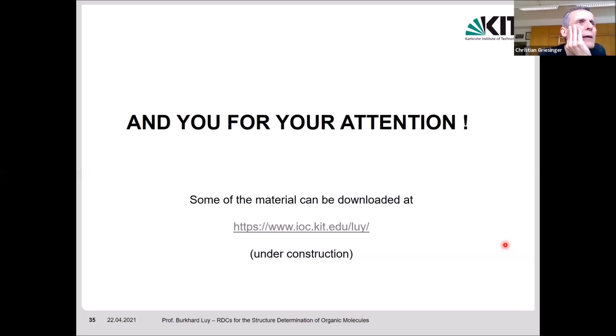There were questions in this direction also from Phil Selenko, the sensitivity comparison with the HSQC, but you answered that now. Sensitivity problems also from Stefan Painter. He also asked, did you already test a carbon-coupled Shaka HSQC to look at conformations of peptides and proteins? Carbon-coupled, to measure RDCs or something like that?